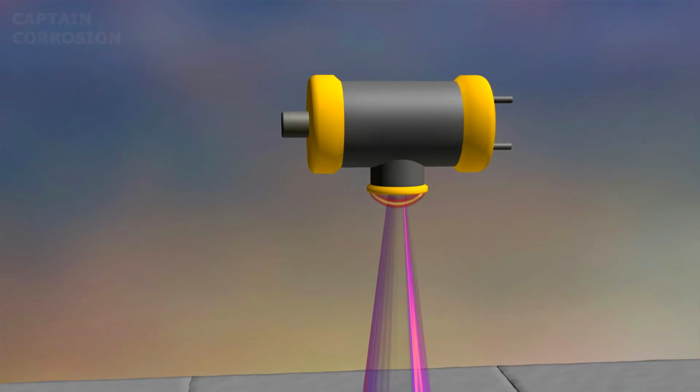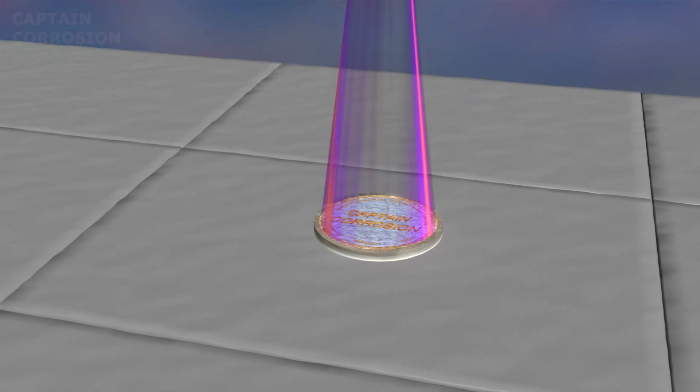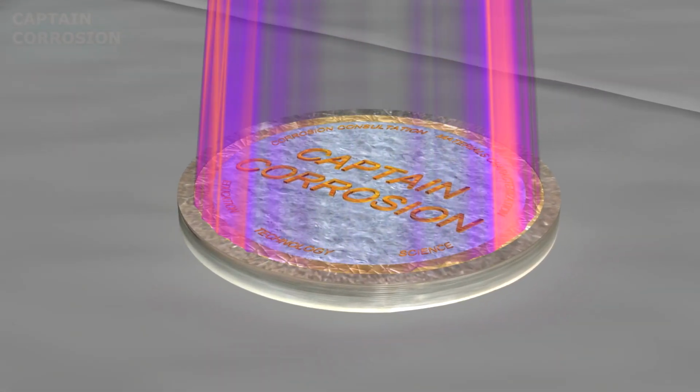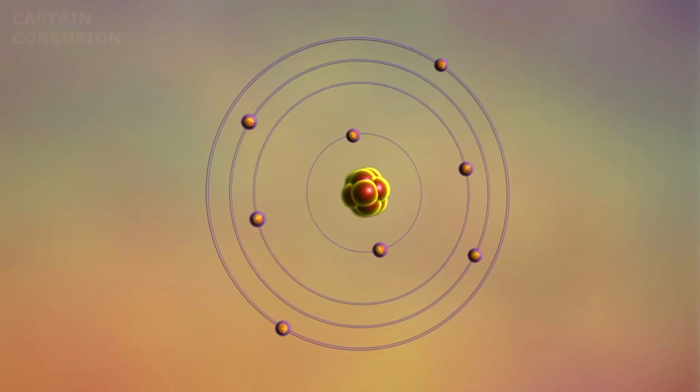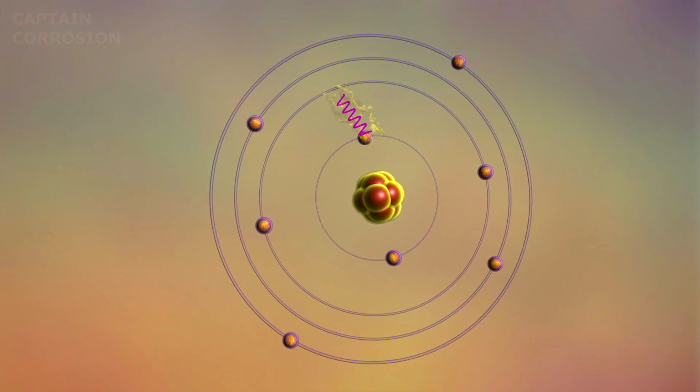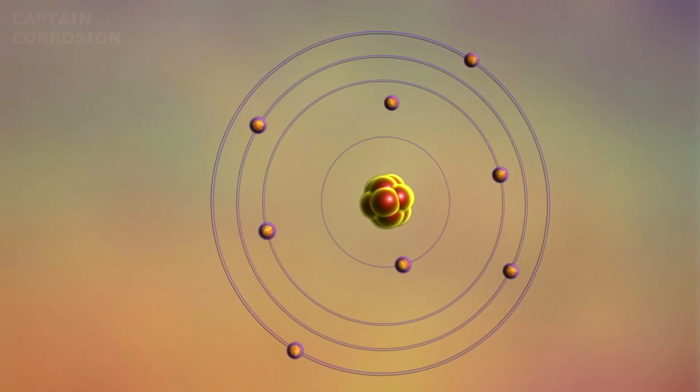In X-ray fluorescence spectroscopy, an X-ray source is used to irradiate the sample with X-ray radiation. If the energy of this radiation is sufficient, then it will interact with the atom's inner shell electrons, causing them to be kicked out.